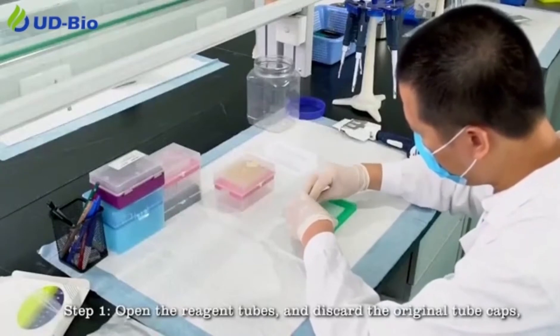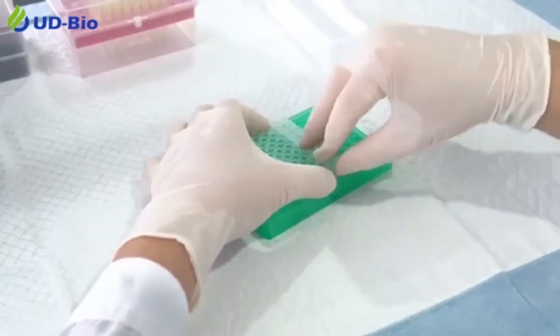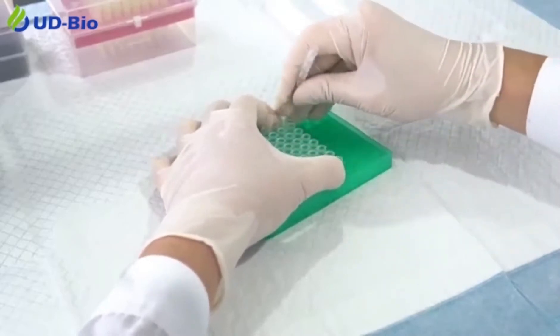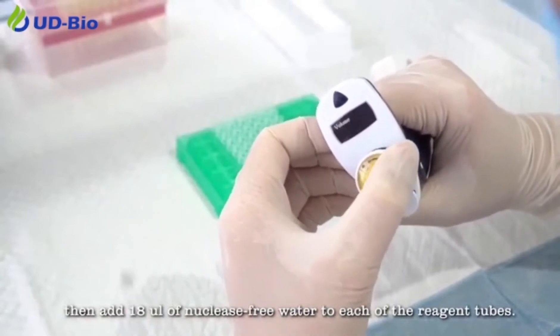Step 1: Open the reagent tubes and discard the original tube caps. Then add 18 microliters of nuclease-free water to each of the reagent tubes.